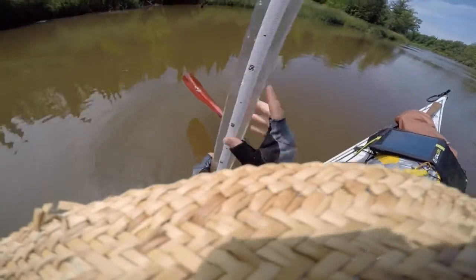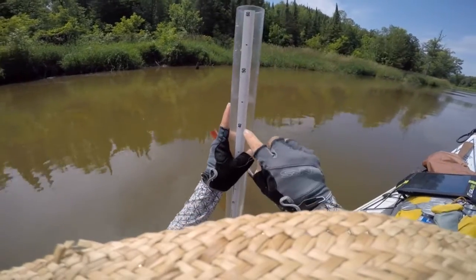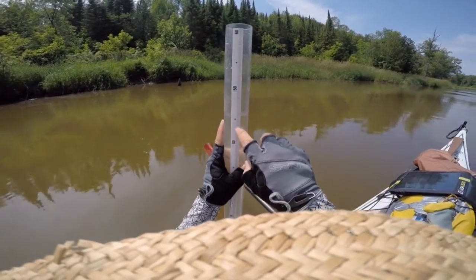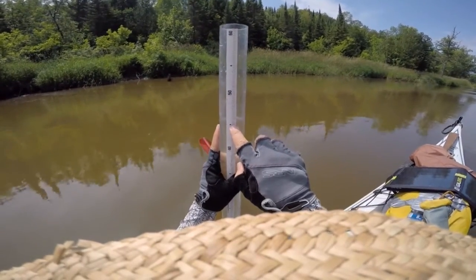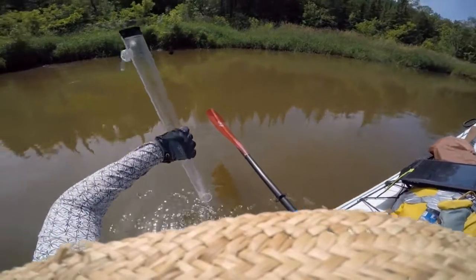And then I just measure where that is. When it's level — 45.2. I'll write that down.